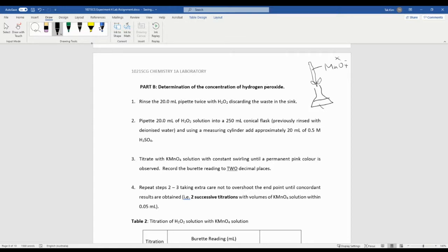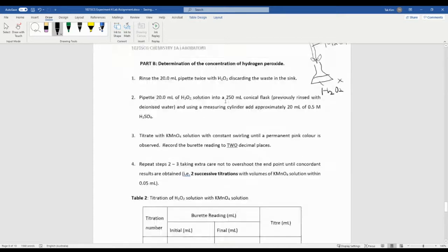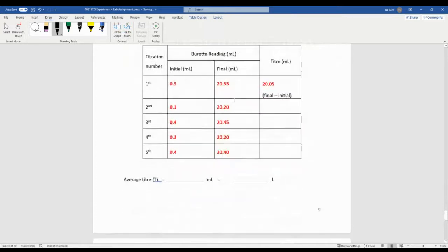And then permanganate. Since we just finished calculating the molarity, this is now known and this is unknown. So it's gonna be the same fundamental. Using this number, you should be able to find out the molarity of hydrogen peroxide. Okay, so it's gonna be the same process.